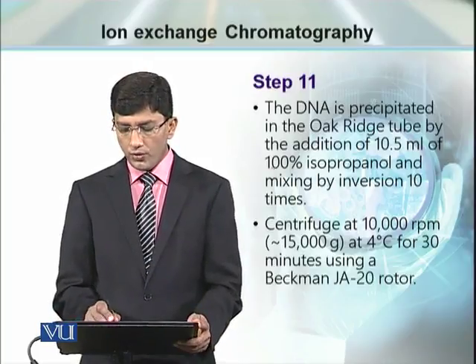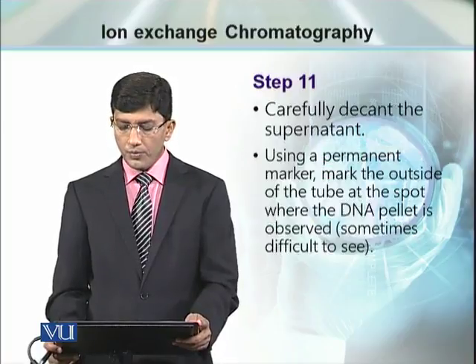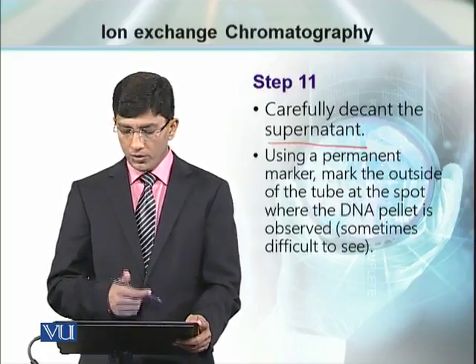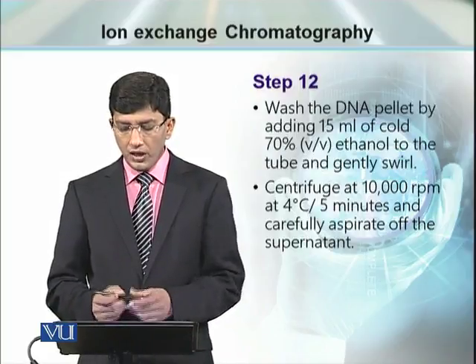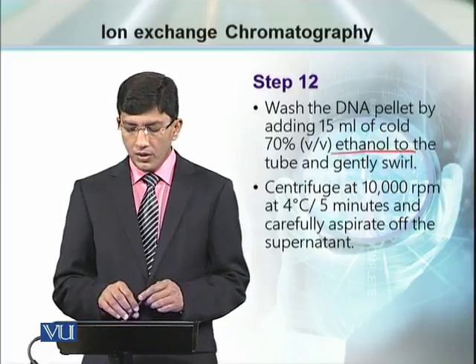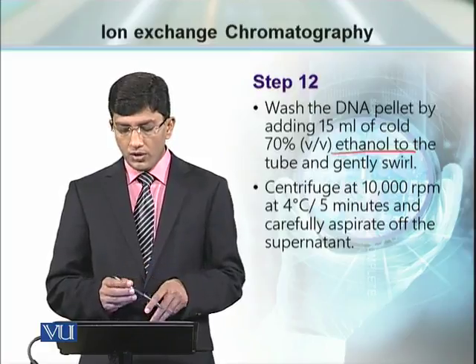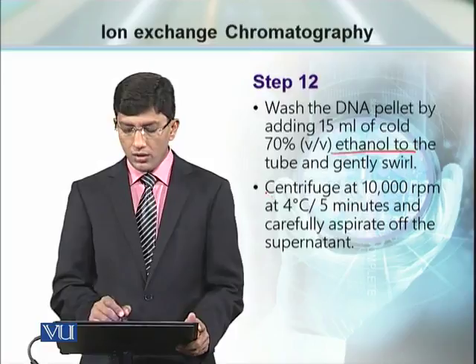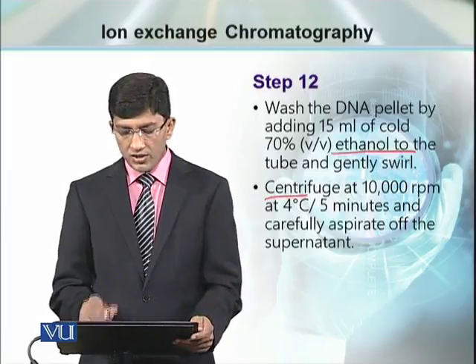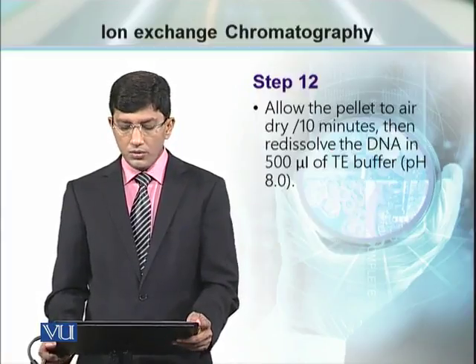For example, use of 100% isopropanol, and then a centrifugation step. Supernatant is not required because all the DNA has precipitated and is now at the bottom of the tube. The next step would be addition of ethanol so that the DNA can be washed. 70% ethanol is used and gentle swirling is going to give the washing to the DNA. Again, centrifugation so that no DNA is wasted through the ethanol removal.